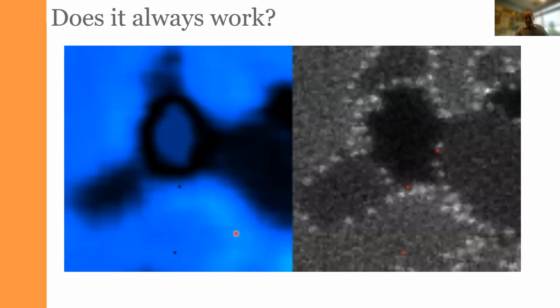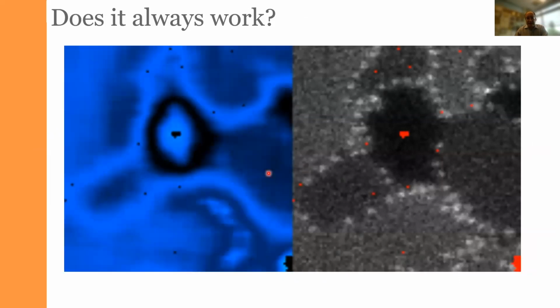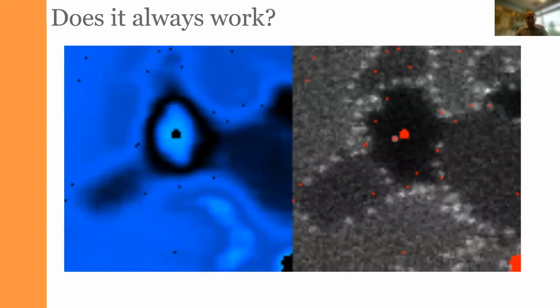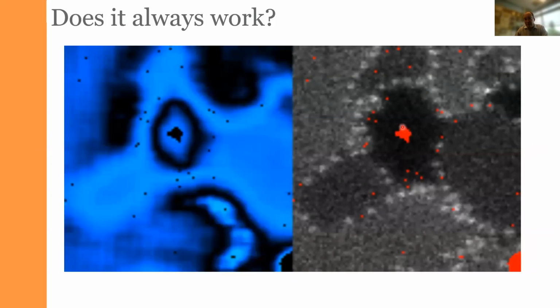Does it happen in electron microscopy? Of course. So this is an example of the automated experiment in 4D STEM that Kevin has been running. So this is our acquisition function. This is our HAADF image. These are the locations where the measurements are taken. Obviously, once the measurements are taken, we take them away from the available scanning points.